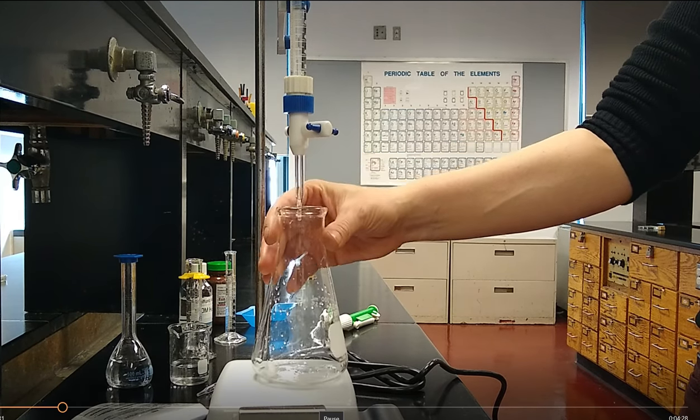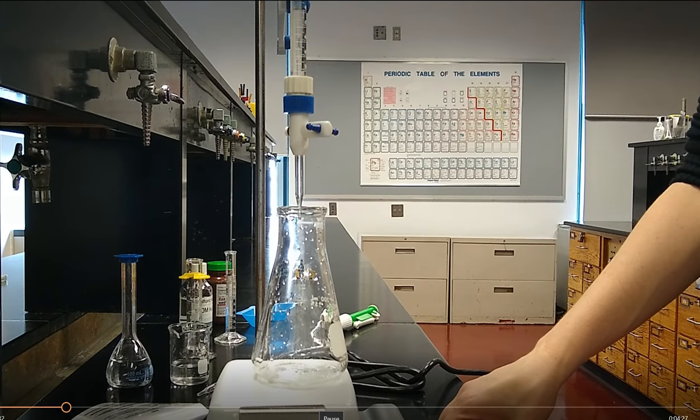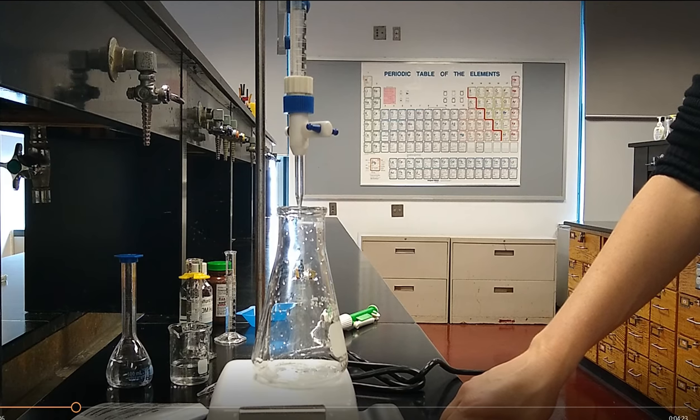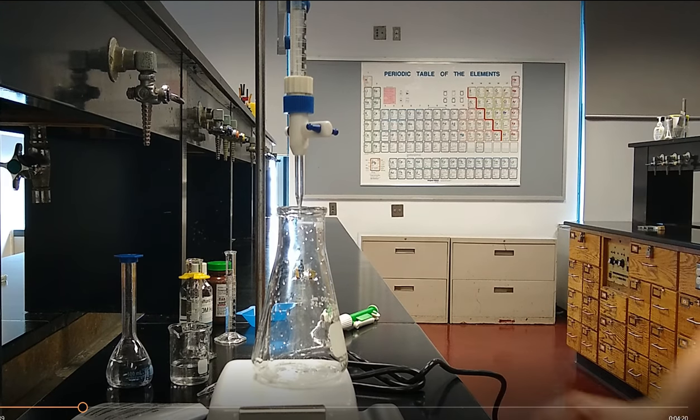We'll get that set up and ready to go. These are fairly involved titrations. You've got a whole lot of materials that are going to have to go into that Erlenmeyer flask before you can perform a titration. So let's review that now.